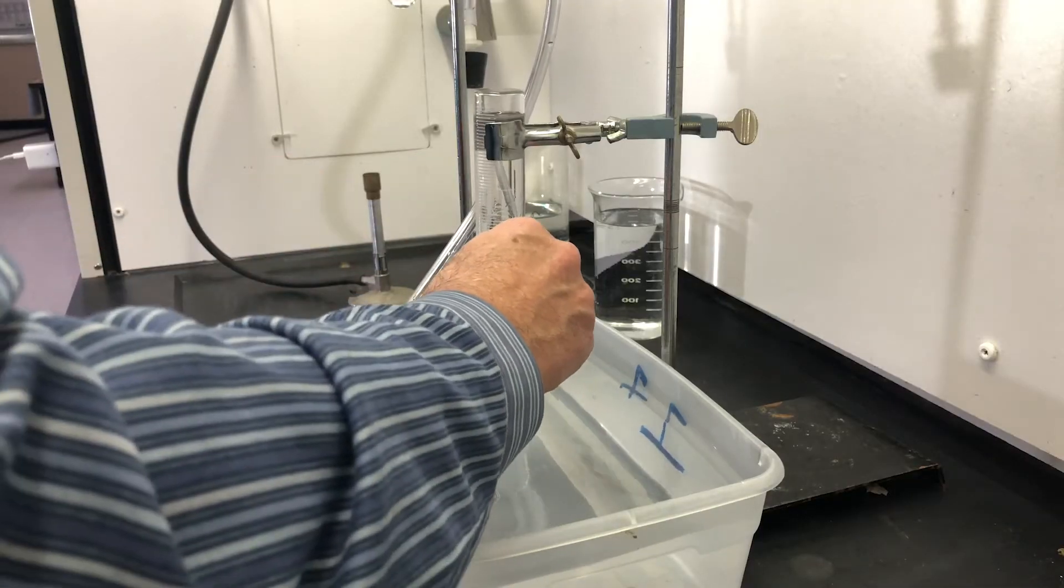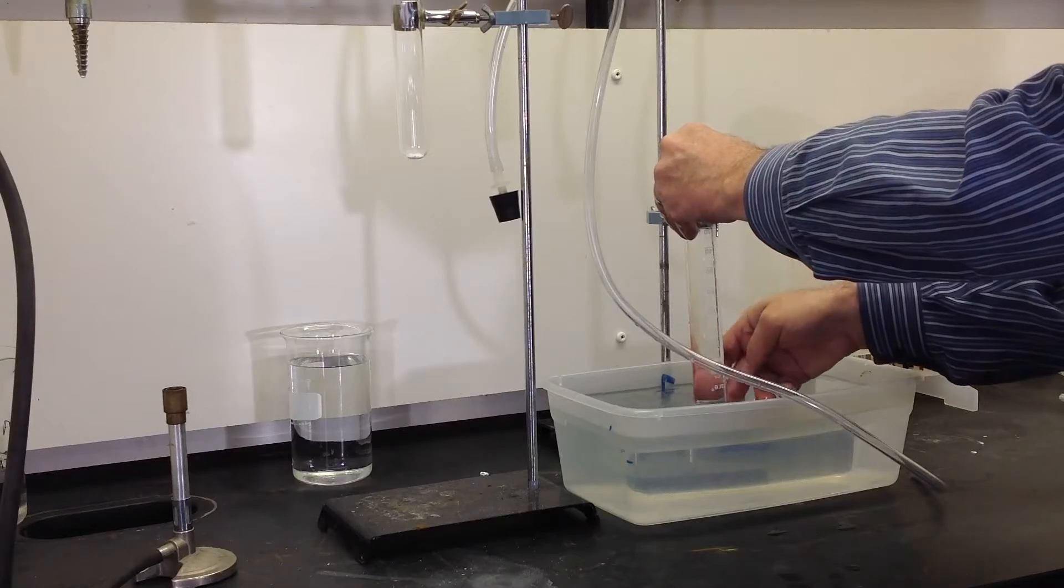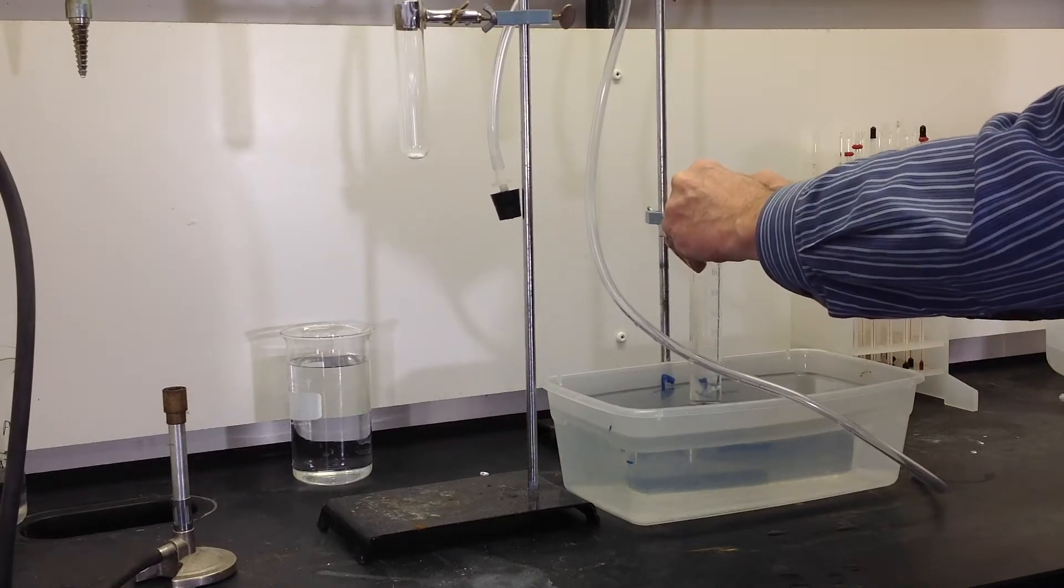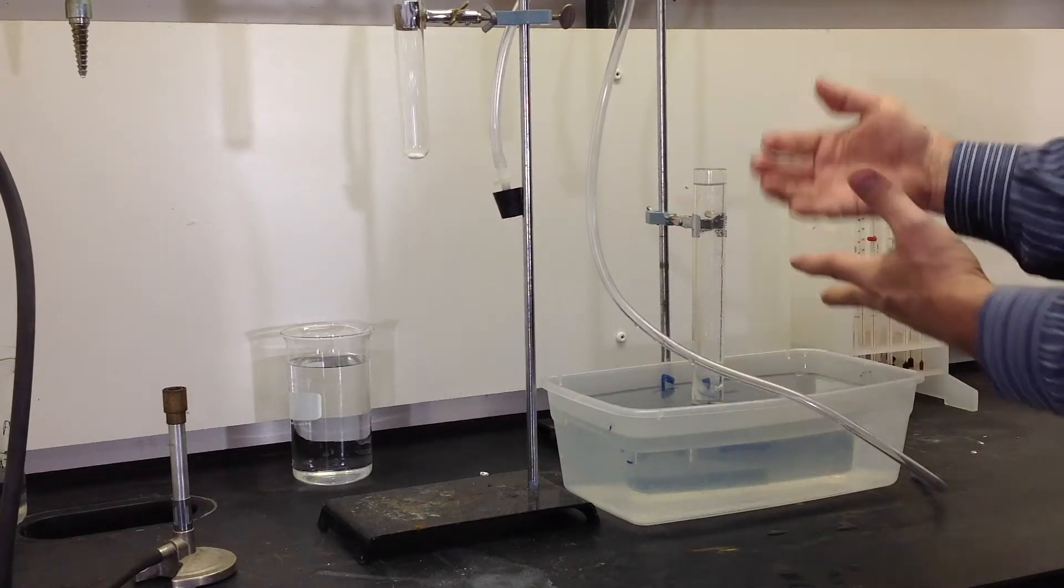Now when I raise this up, I don't want to break the surface of the water with the graduated cylinder. I want to make sure that the mouth of the graduated cylinder stays below the water surface so that I can create this column of water.